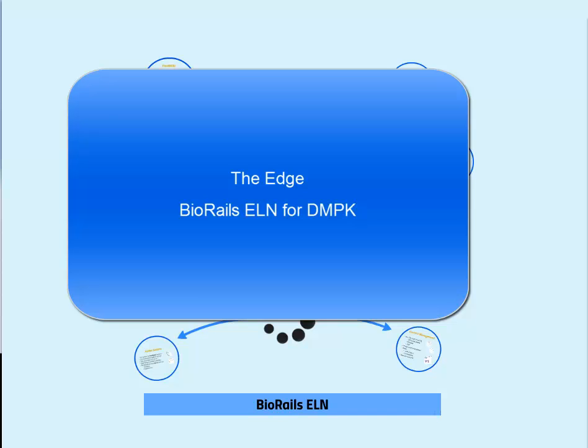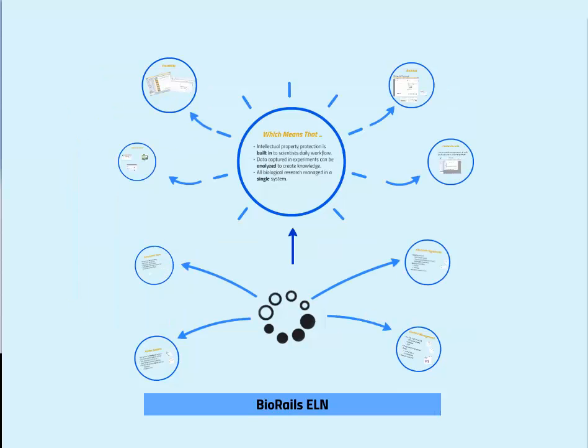Good morning, welcome to this BioRails demonstration. I'm going to show you the features of the BioRails electronic lab notebook and also take you through how they're used in the context of a request fulfillment workflow focusing on the needs of a DMPK CRO laboratory.